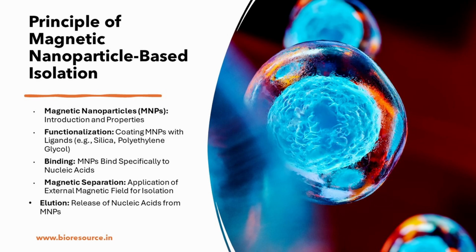So this needs to be experimentally determined to see how well the nanoparticles and the nucleic acid interact. So we can check the flow-through after the binding condition. The flow-through can be checked to see the presence or loss of DNA in the unbound fraction, to understand how much binding is happening in this solution condition. So ionic strength and pH can be varied to get the optimal binding.